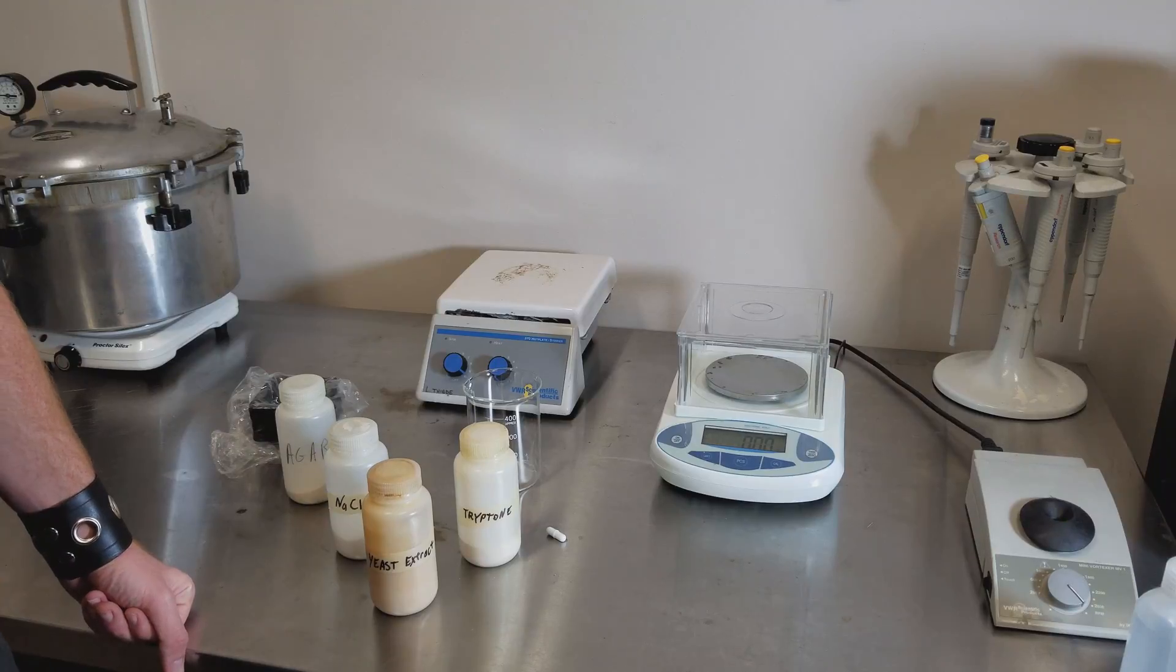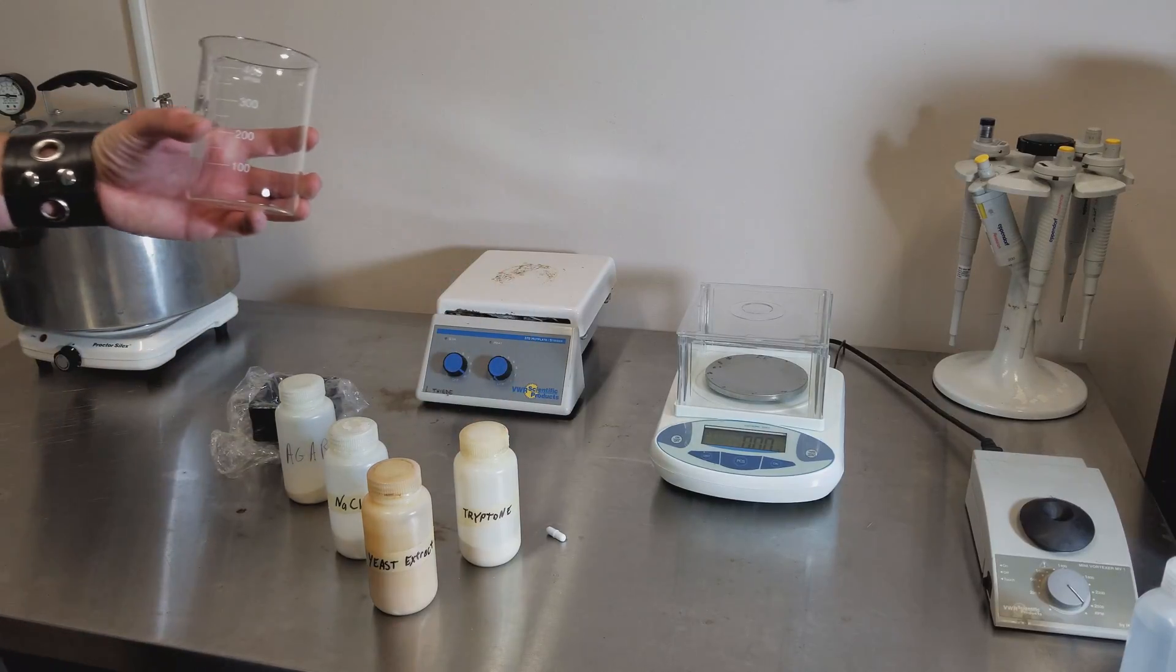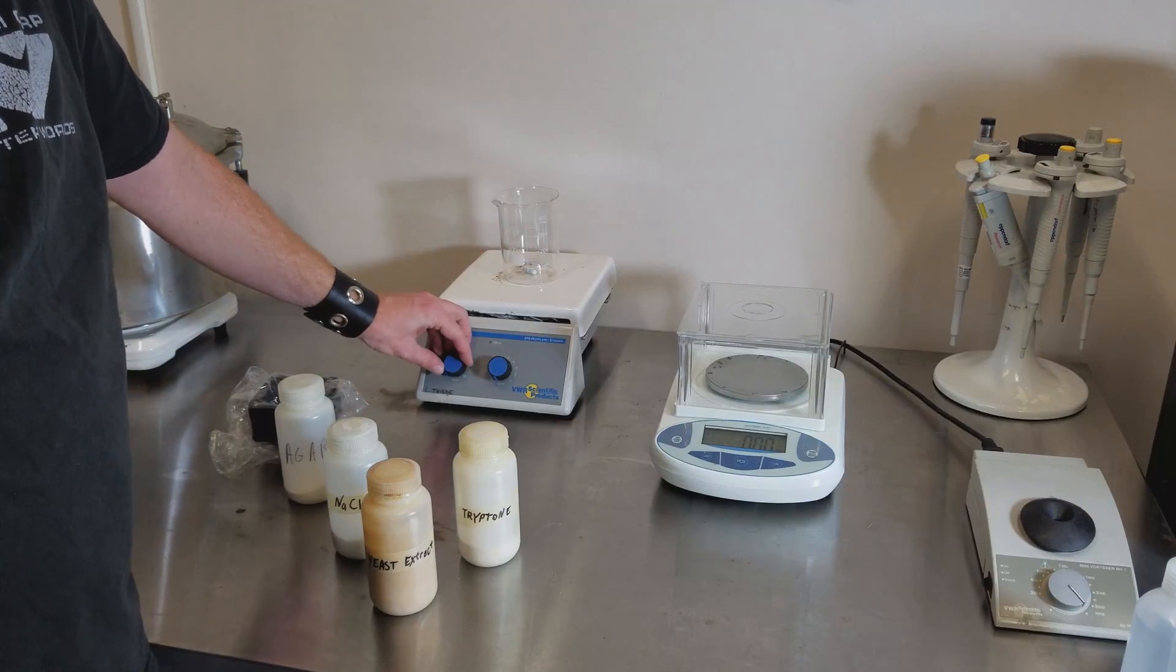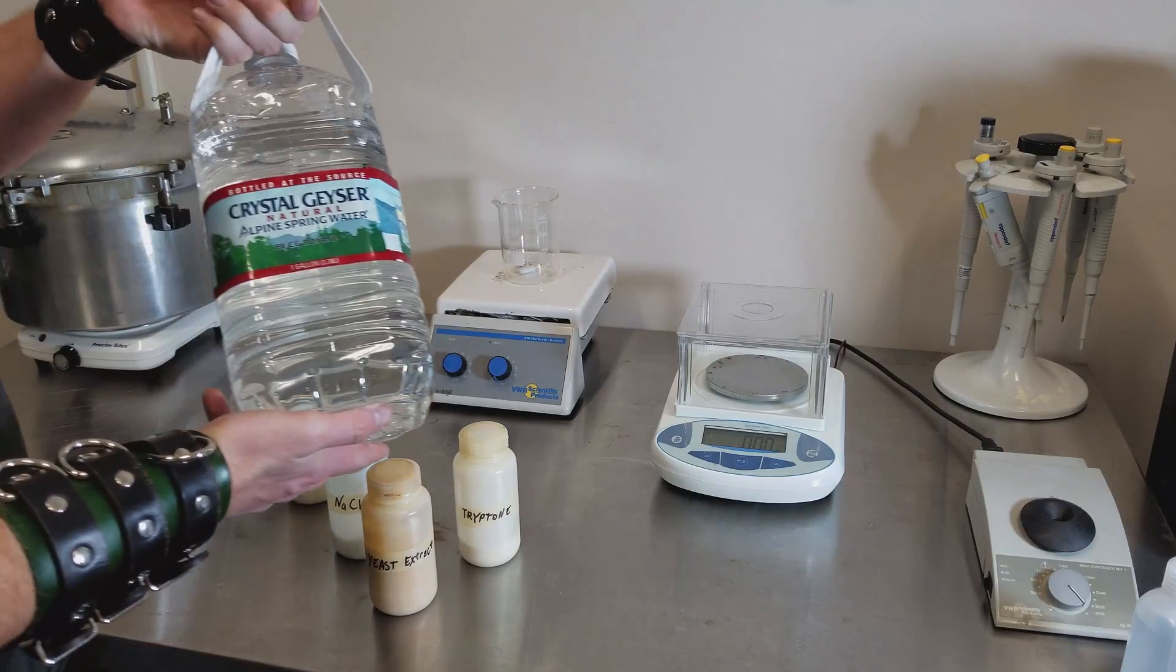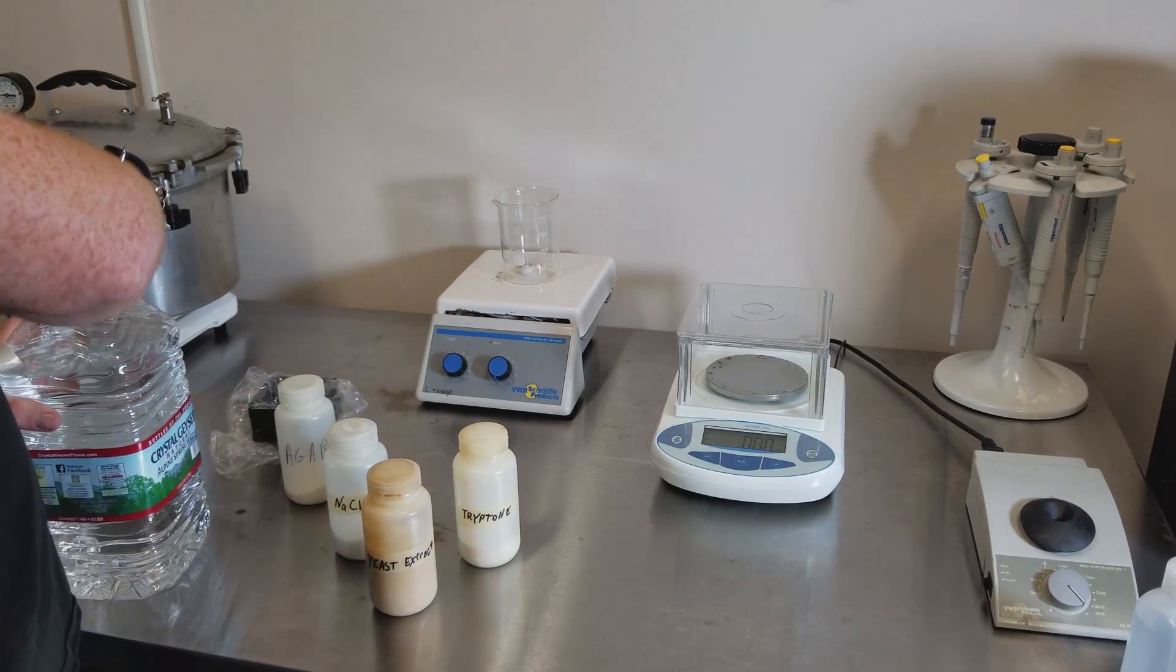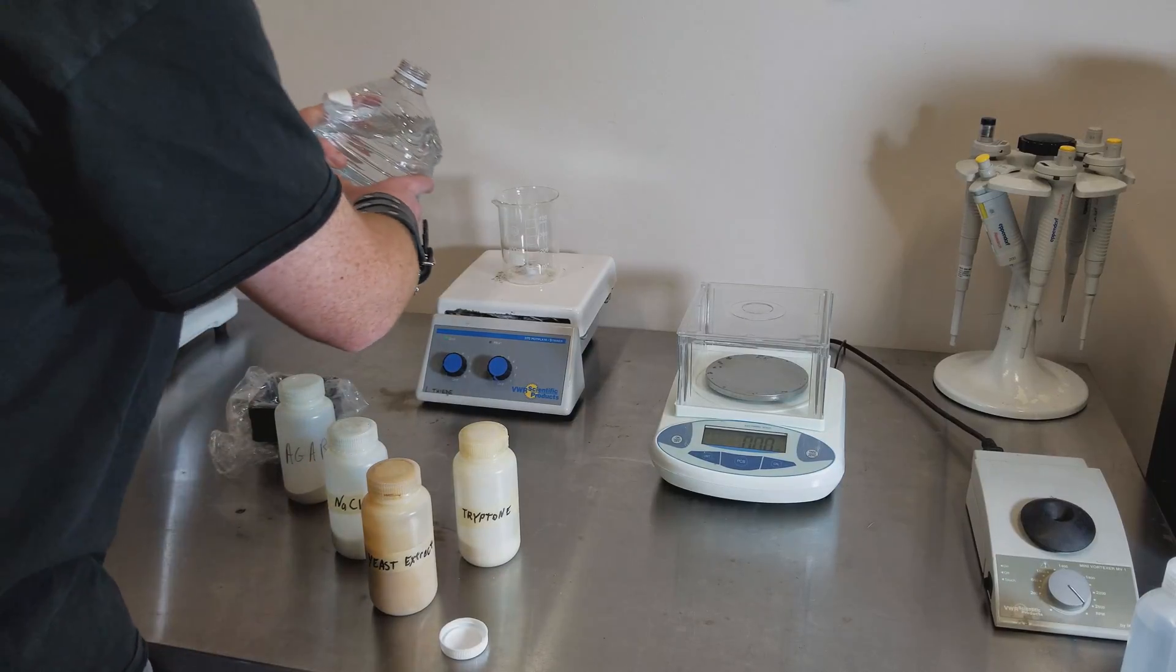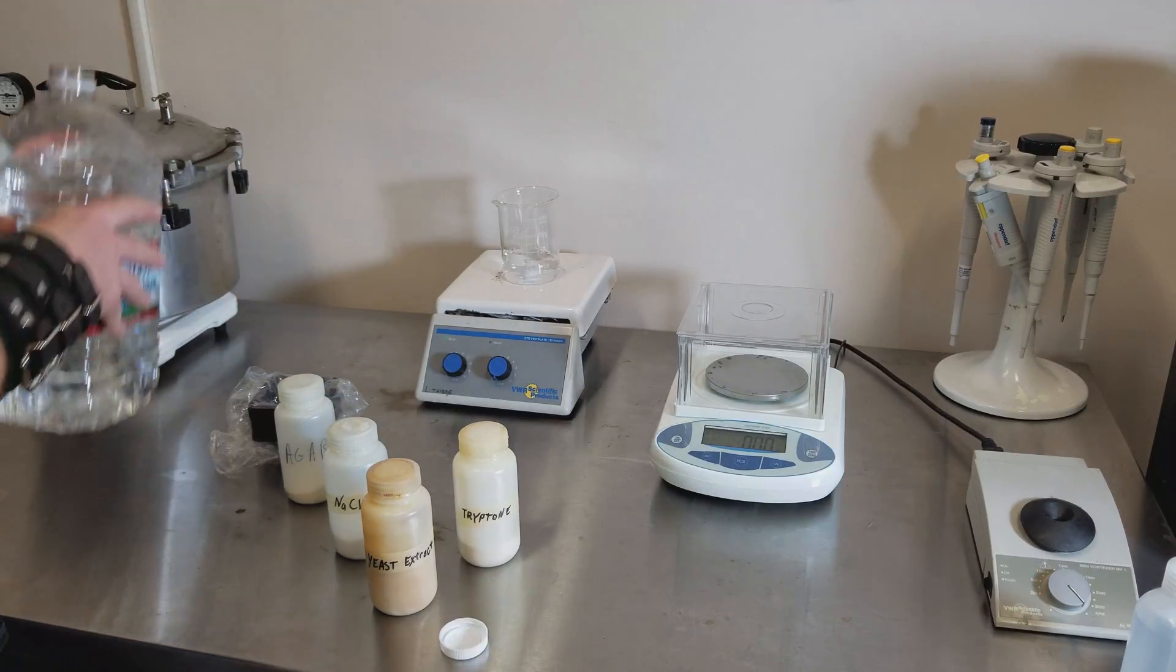Today we're going to be making about 250 milliliters of growth medium. So we start by taking a beaker and adding a magnetic stir bar to that beaker. If you have a magnetic stirrer this helps out a lot. Next you'll want to add some DI water. You don't want to put in 250 milliliters but you want to put in enough to mix what we're going to be working with. We'll top it off at the end. We'll come back to why that's important later.